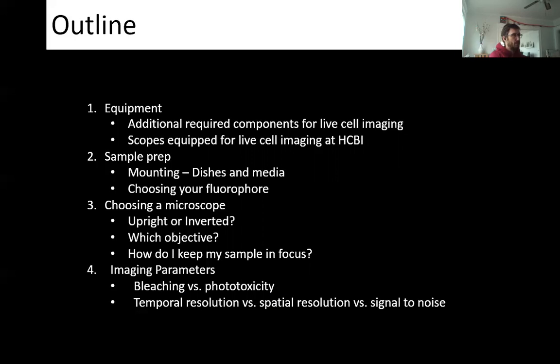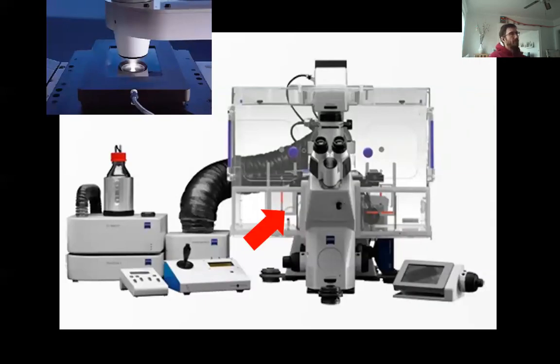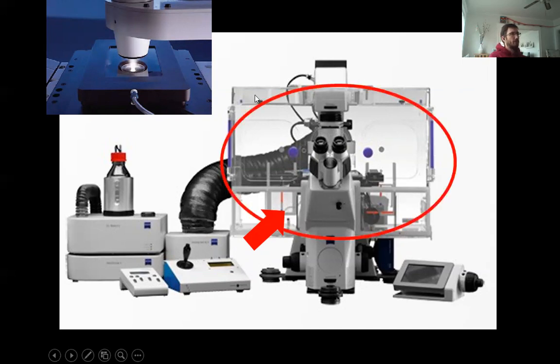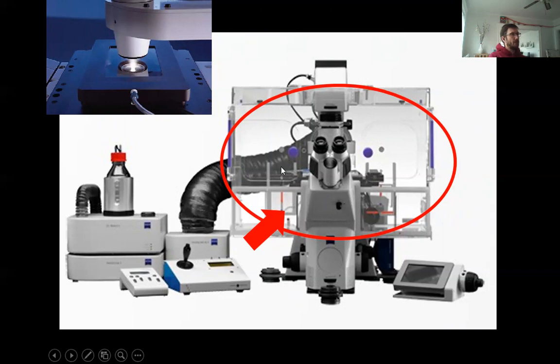Let's start with equipment. Here's a live cell setup with our standard inverted microscope in the middle. The first thing you notice is this big plexiglass box around the outside — you've probably seen these in the HCBI. We have one on our 880 and one on the new Elyra. It's just a big plexiglass box with a large black tube coming off a heater and a fan that blows hot air into the microscope to warm up the environment.